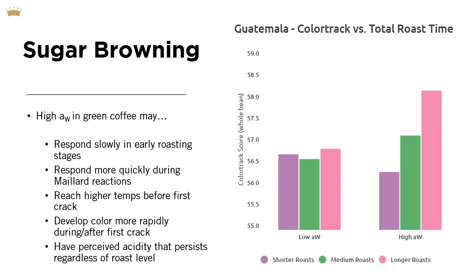Available studies make note of the increased rate or likelihood of browning reactions, such as Maillard stage during roasting, in correlation with water activity as it approaches roughly 0.70, which is to say that in coffee, higher water activity levels, while increasing the risk of new microbial growth or reduced shelf life as green, might also have some interesting potential in the roaster.